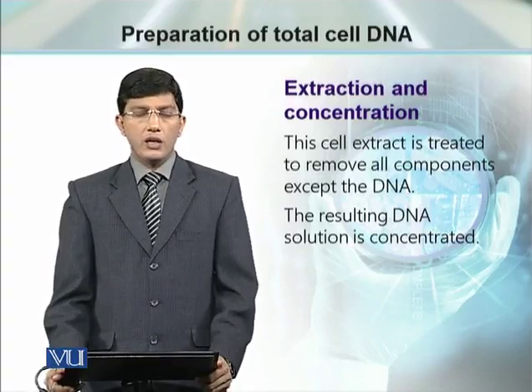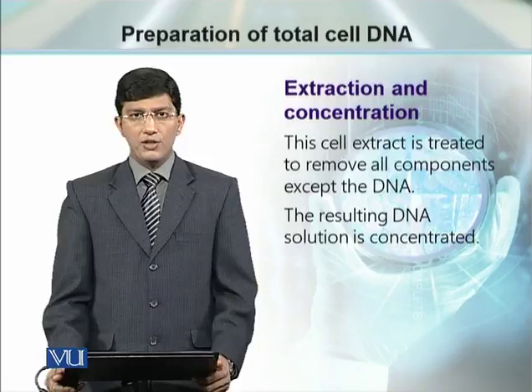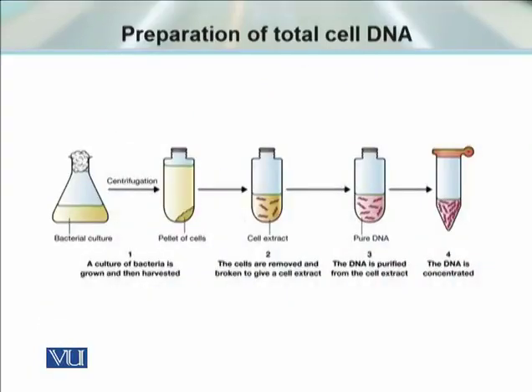Bacterial cells or the microorganism cells have 2 types of DNA, genomic DNA and the plasmid DNA. In biotechnology, most of the time when we are working, we need plasmid DNA. In biotechnology, there are different methods to prepare the plasmid DNA.